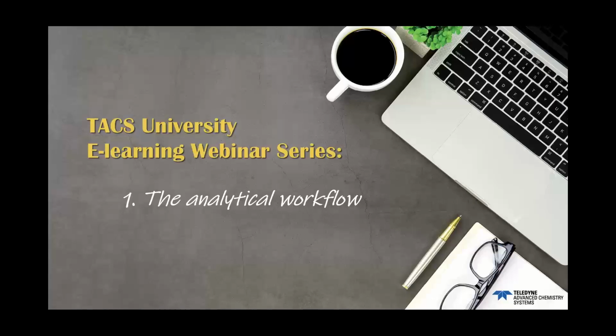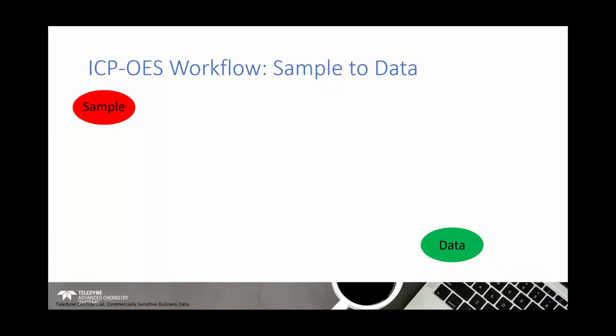So the analytical workflow. As I mentioned, an analytical workflow can pretty much be applied to any kind of analytical technique. There will be some deviations, but there are a lot of similarities. I'm going to start off with what we all have, which is a sample, represented here in red on the left-hand side of the screen.